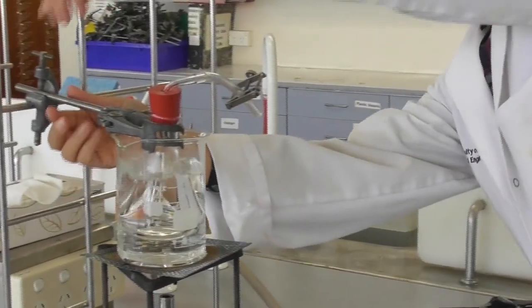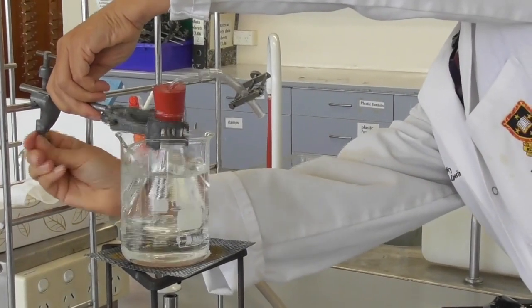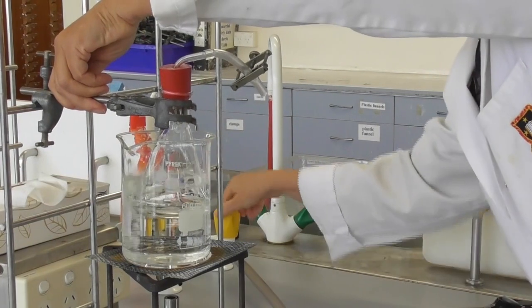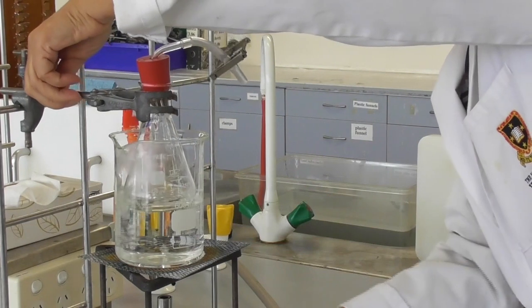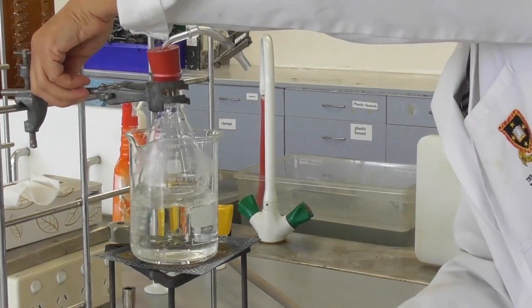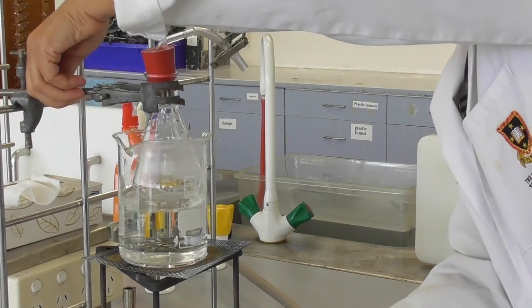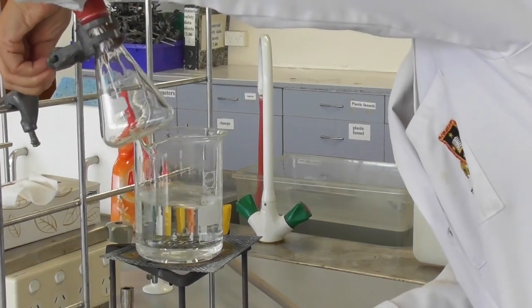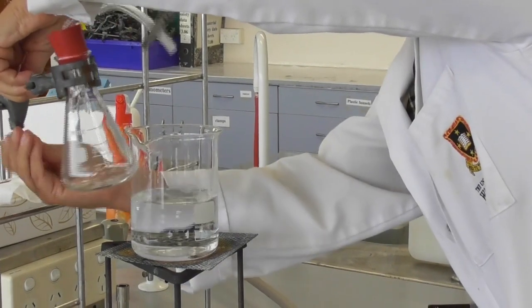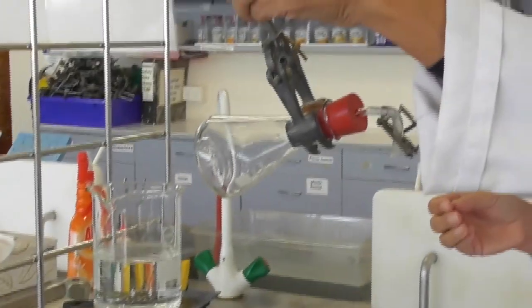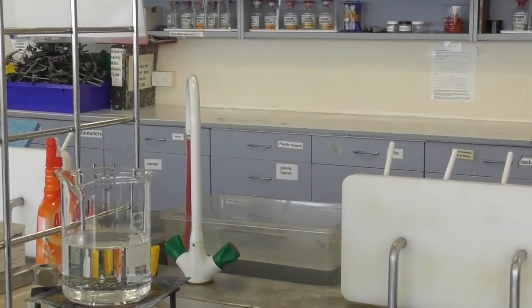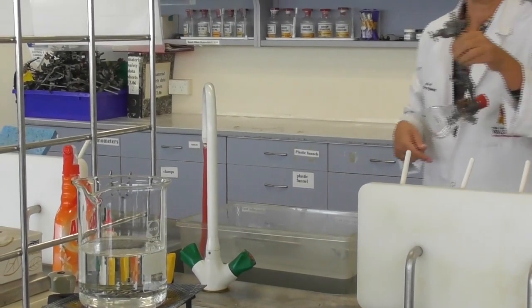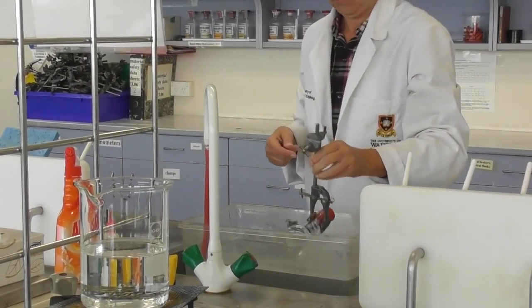Then we have to disassemble our apparatus. Ideally we turn off the gas first and it's best to take the whole setup, the clamp including the flask, out of the boiling water and take it to the sink where we have a container with cold water where we submerge the flask completely.